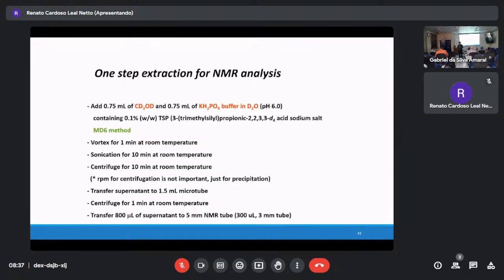Then it's a very general question. Now, 30 milligrams I extracted, and NMR is not very sensitive. So I can detect only major compounds, like plant glucose, sucrose, plant hormones, or some minor secondary metabolites. Probably you cannot detect them in NMR. The question is, how dare I say it's metabolomics, because metabolomics is supposed to cover all metabolites? It's the same as in mass spec. How?